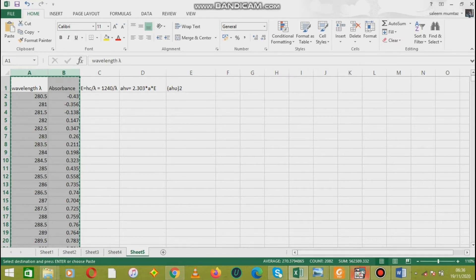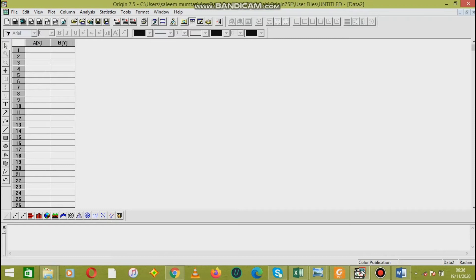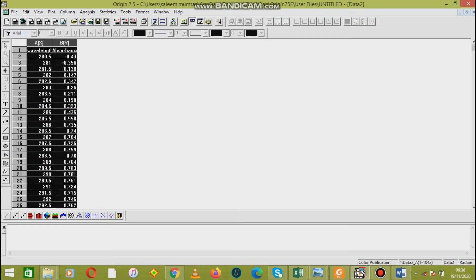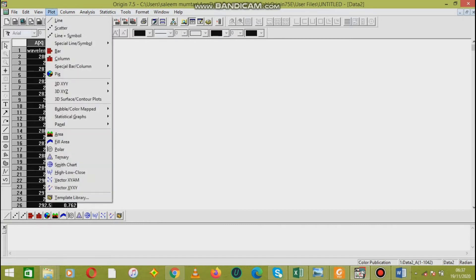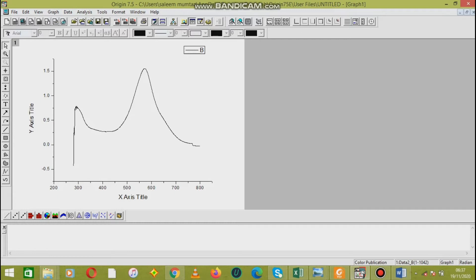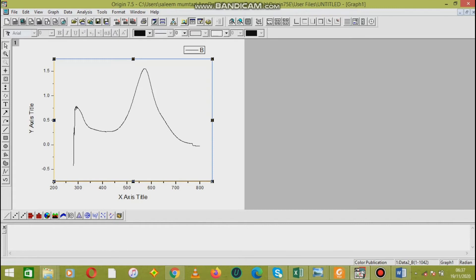We open a new window and paste these parameters into positions A and B, where at position A we put wavelength and at position B we put absorbance. Then we plot a graph by selecting the line. Here is the graph between absorbance and wavelength — at the x-axis we take the wavelength, and at the y-axis we take the absorbance.